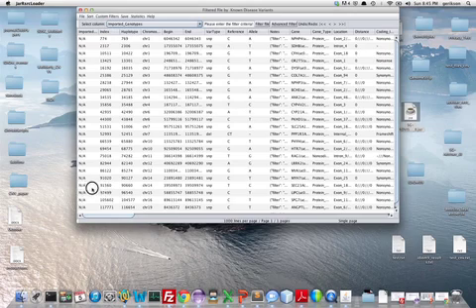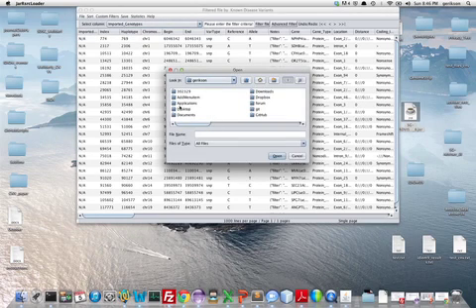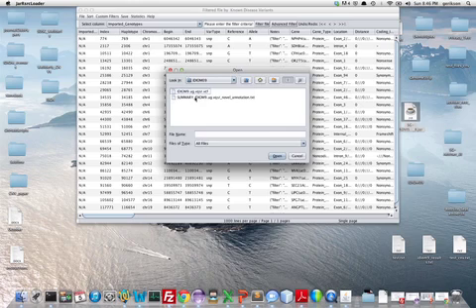However, since this is a quartet, meaning mother, father, the proband, who is the affected individual, and the sister, you will have to load and compare the genotypes, so load and compare VCF files, to see if any of those category 1 variants are homozygous or de novo. So load VCF file.